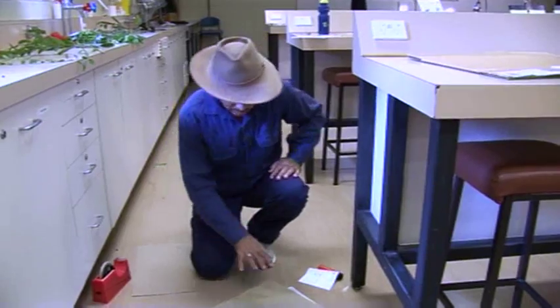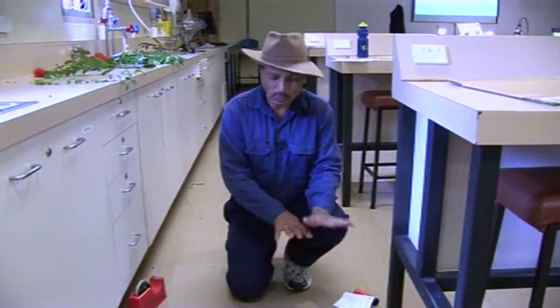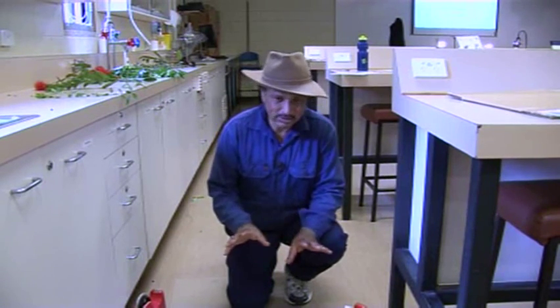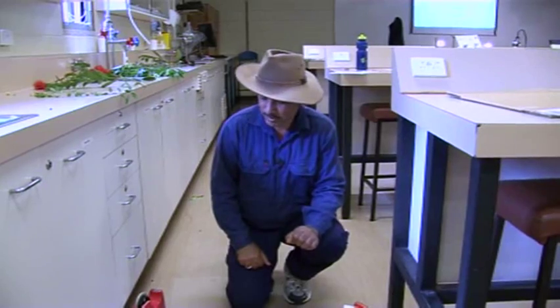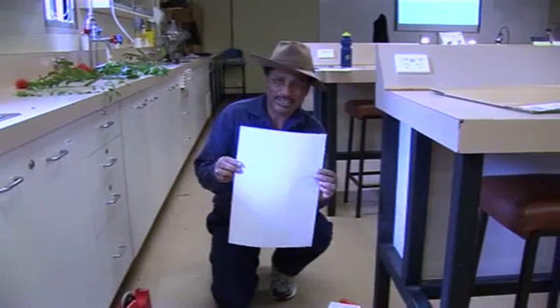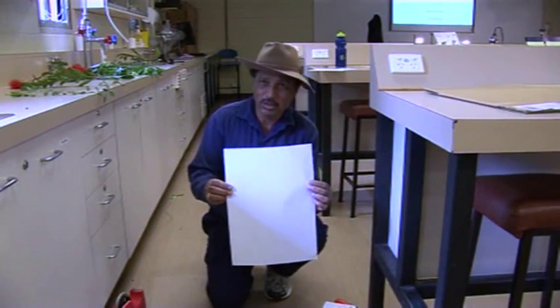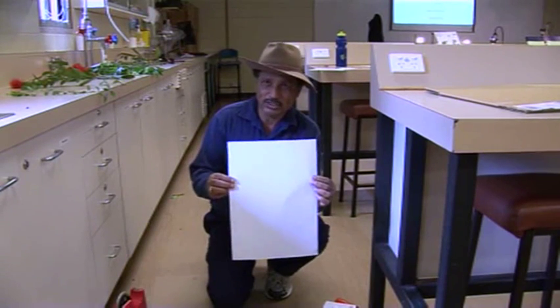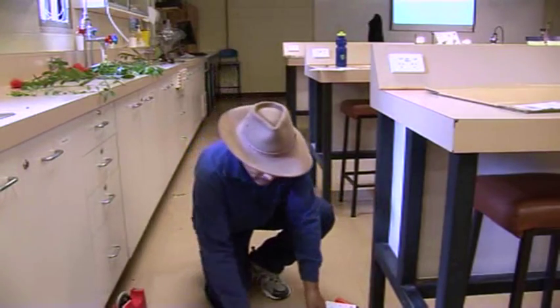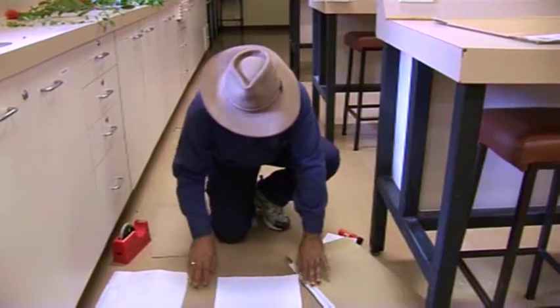Now that we have the samples already collected and dried, we need to transfer them onto an A3 size white paper. And this is the A3 size white paper. You will learn the details when you come back to the residential school, but at least you should be aware of what is expected of those samples. So once those samples are dry, you need to transfer them onto the A3 size.